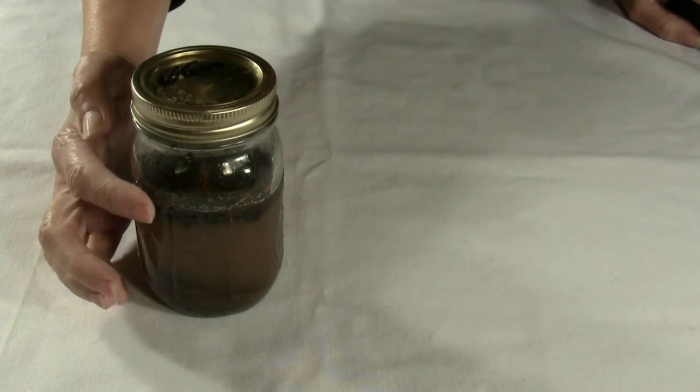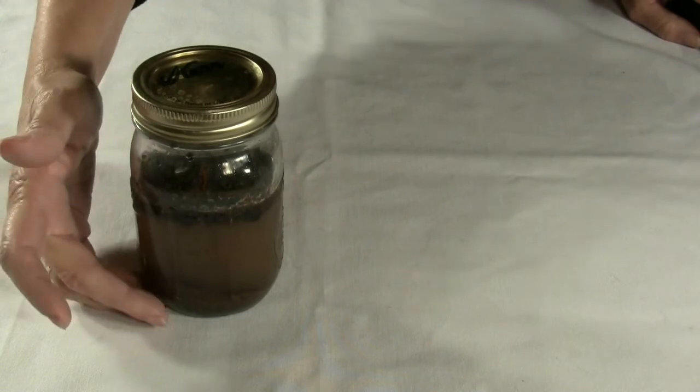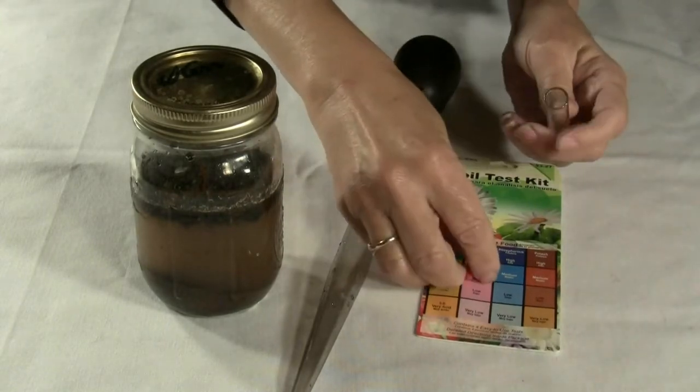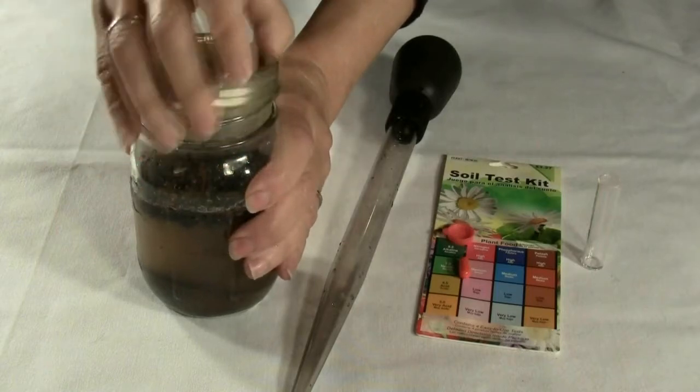The soil settles to the bottom of the jar. Anything lighter than water, like bark mulch, floats — don't worry about that. Use a baster to draw up a sample of water and place it in the vial. We'll start by testing for potassium.